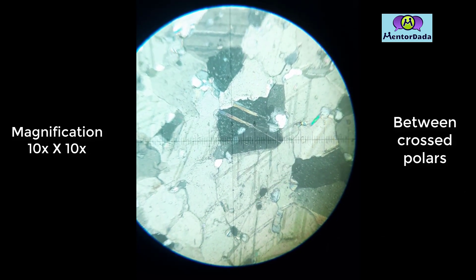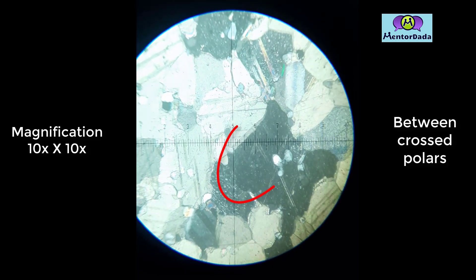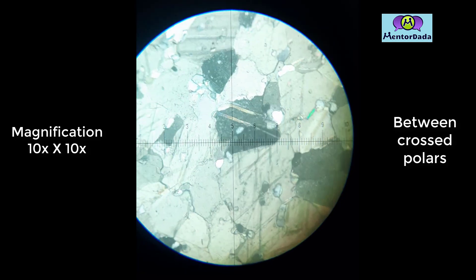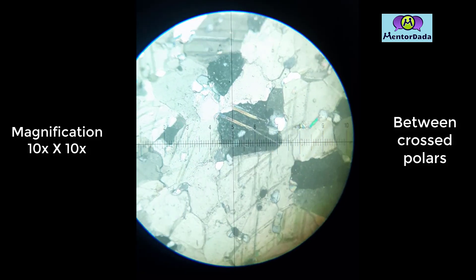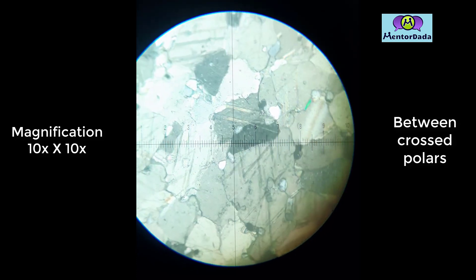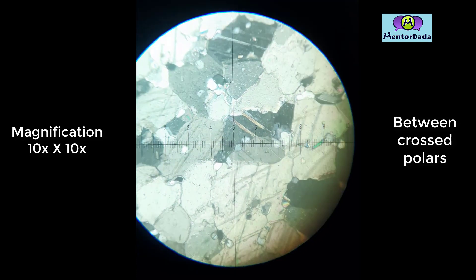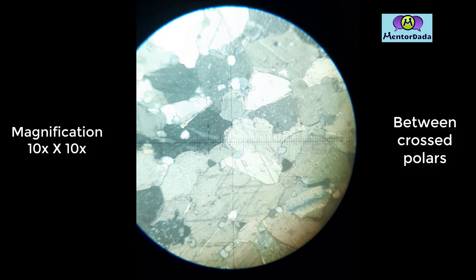When we rotate some degrees of the stage, the mineral goes to extinction, so we can say the mineral has inclined extinction. We can also see beautiful lamellar twinning in this mineral, which is very prominent.